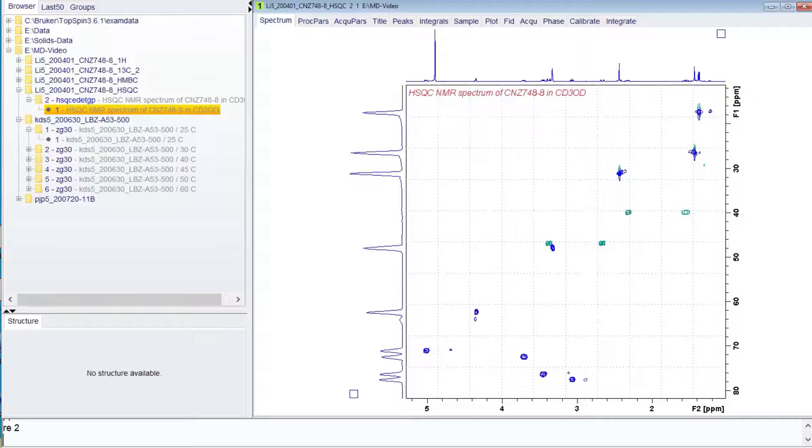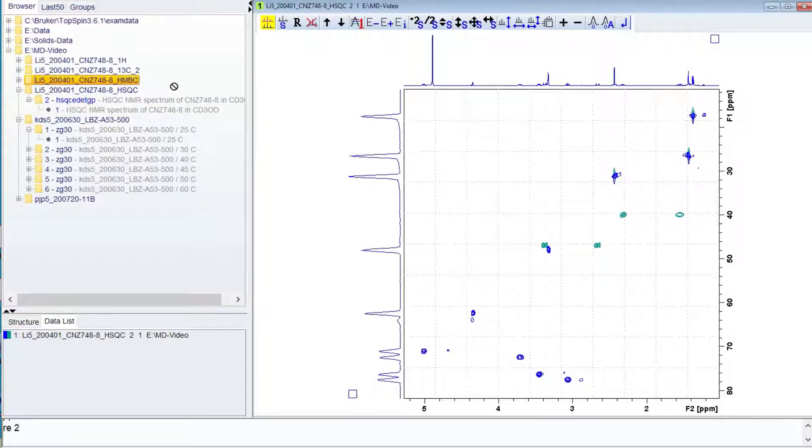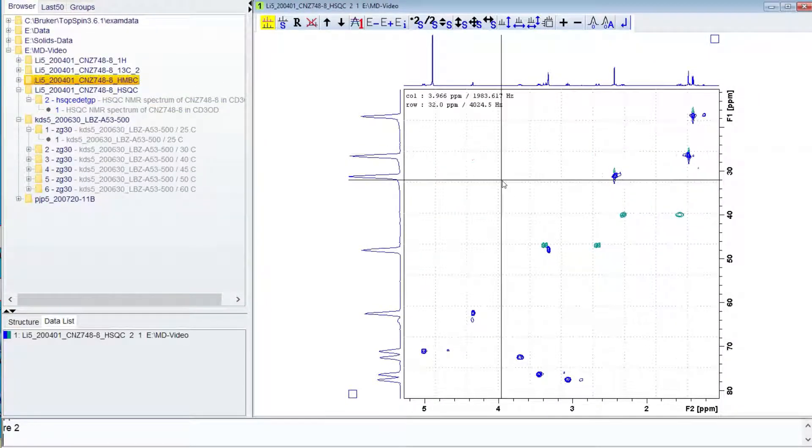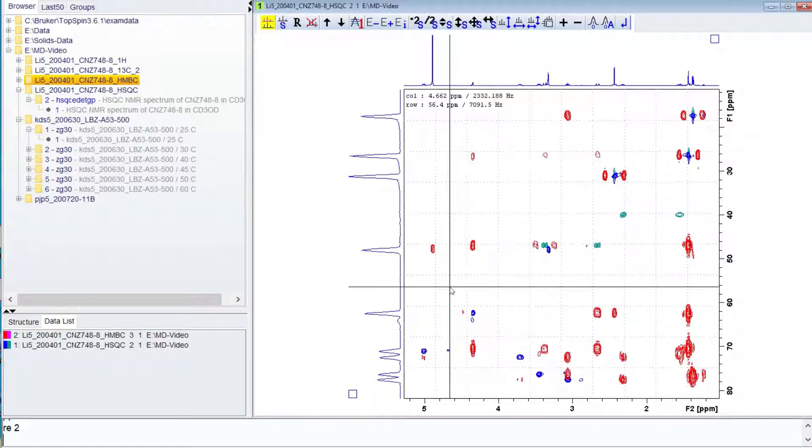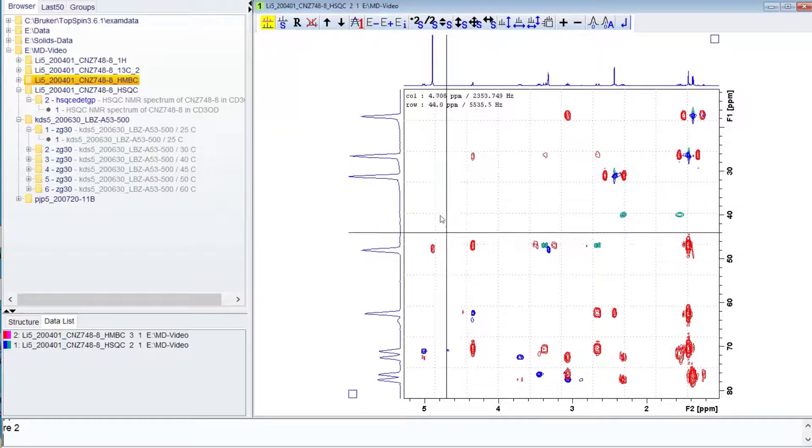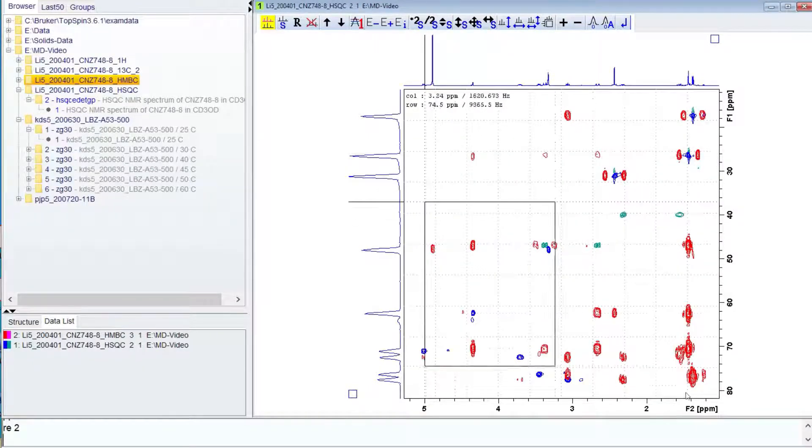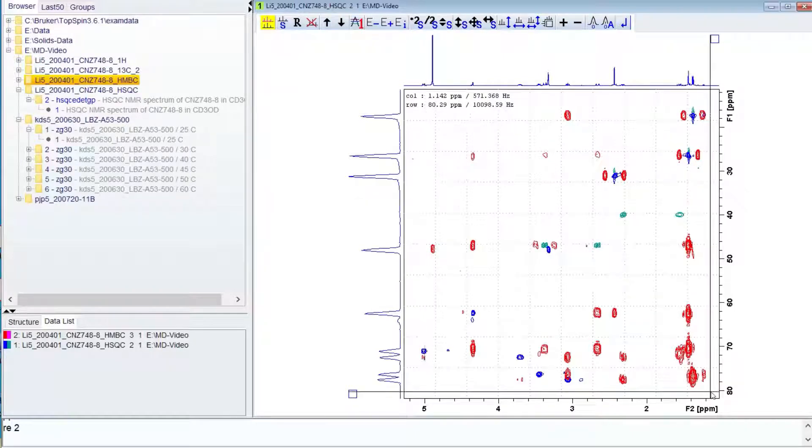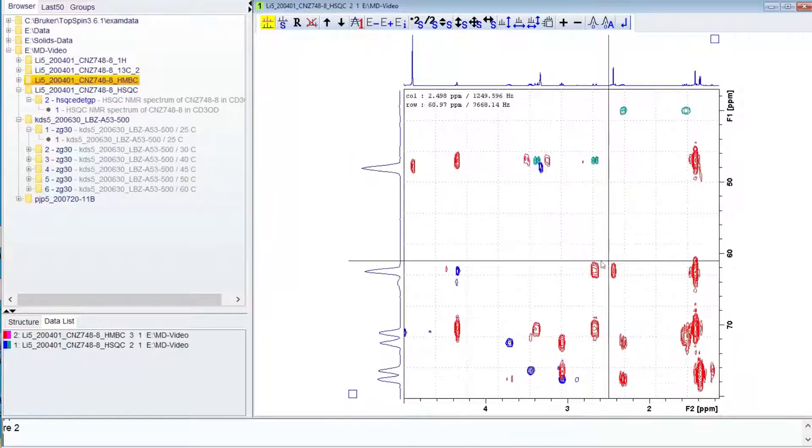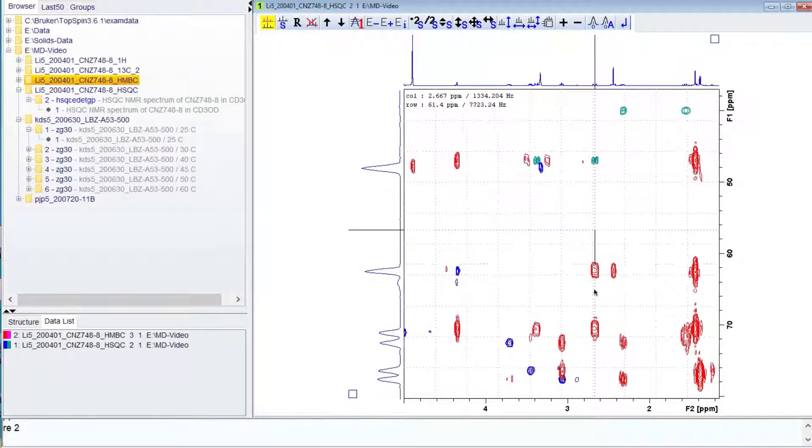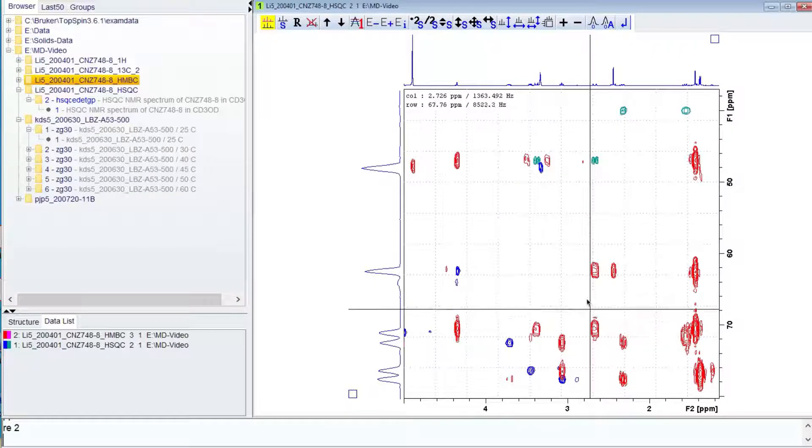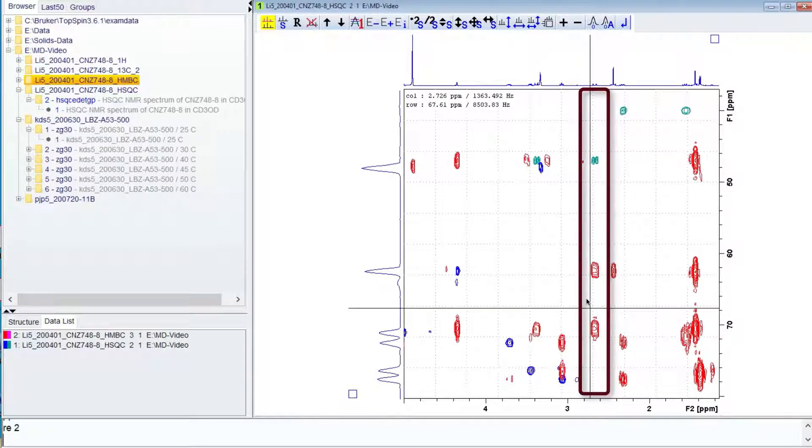To help interpretation of HMBC spectra, which shows correlations over multiple bonds, it is helpful to overlay the two data sets. In this case, the HMBC results are the red contours while the HSQC remains blue and green. The peaks under the protons form columns that show the single bond correlation and the multiple bond correlations.